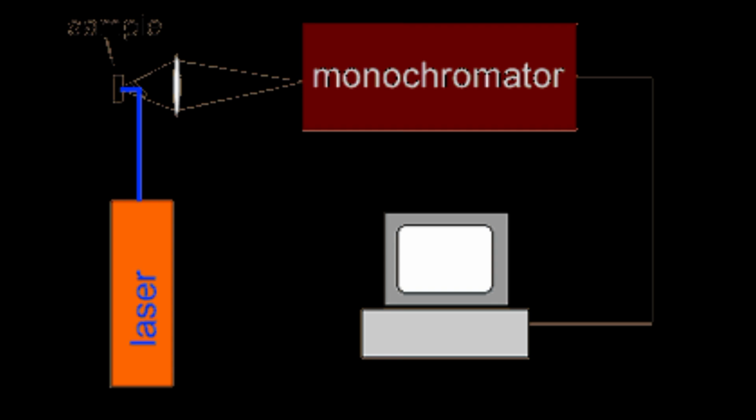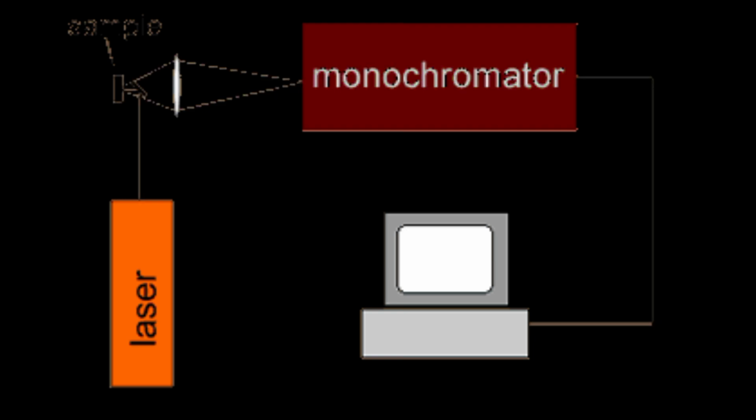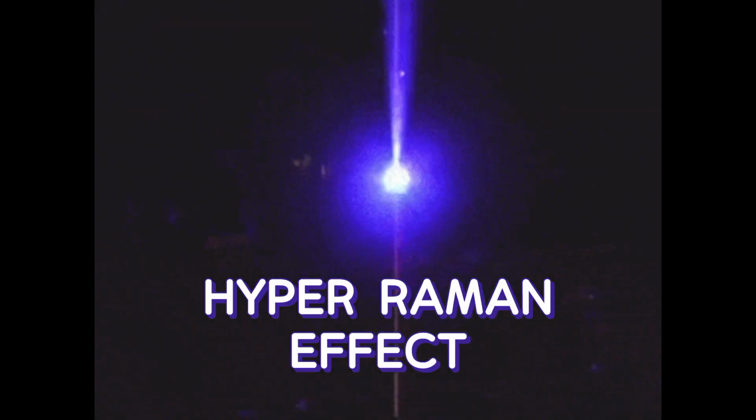And this experimental procedure includes a monochromator and photomultiplier tubes in the experimental setup, which was simpler as compared to that of the Hyper Raman experimental techniques. The Hyper Raman is the nonlinear extended Raman spectroscopy, which has some technical advancements in it.